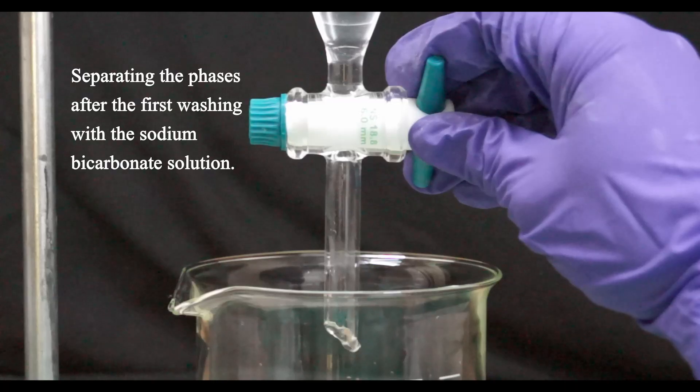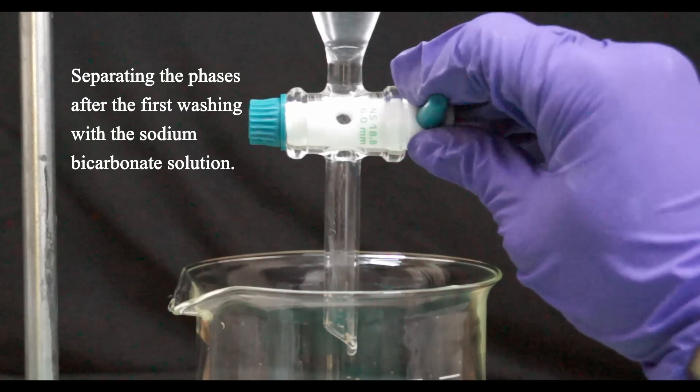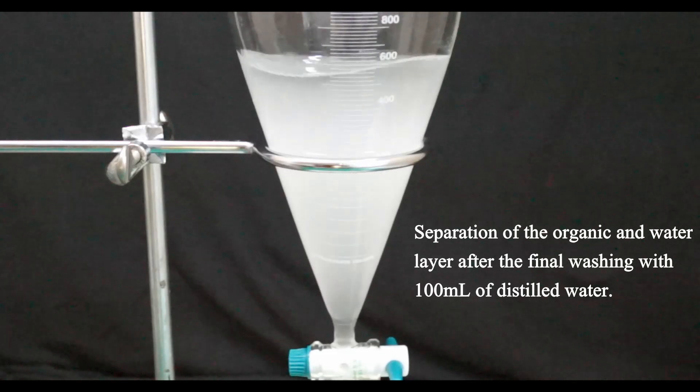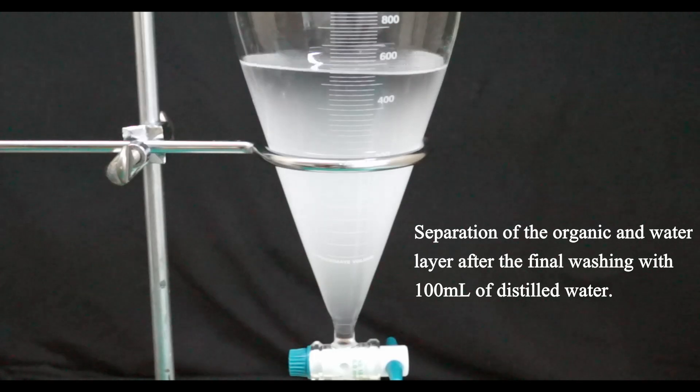After careful shaking and frequent venting the phases are separated and the washing is repeated two more times. On the second addition of sodium bicarbonate solution there was almost no gas evolution but to be sure that all of the hydrogen chloride was removed I performed the third washing with the sodium bicarbonate.